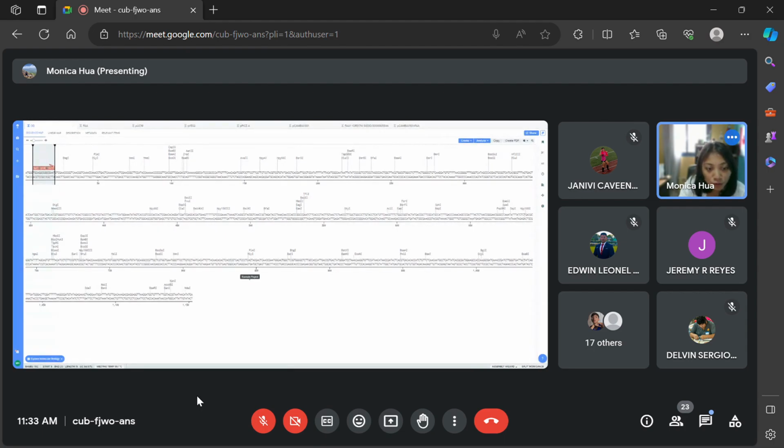For you guys, make sure you have your restriction enzyme site. So what you do for the forward, you do for the reverse too? Yep, what you do for forward, you do for the reverse.